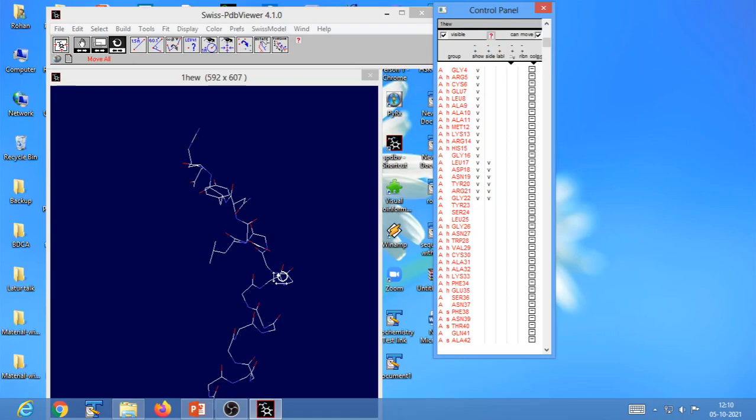Now there are also two narrow columns. We are talking about these two narrow columns at the left of the group columns. The first column is populated with the letter A, as you can see here. In previous revisions of this entry, this column used to be blank. When the current model contains only one protein chain, this column may remain blank.